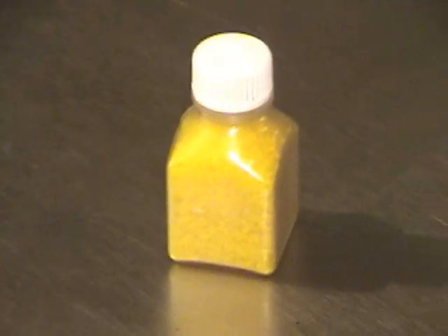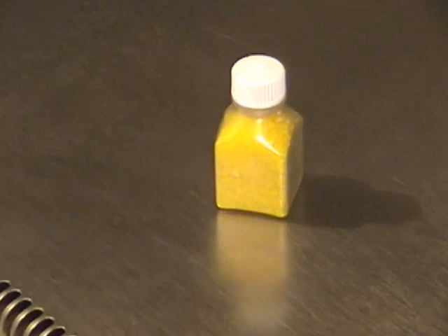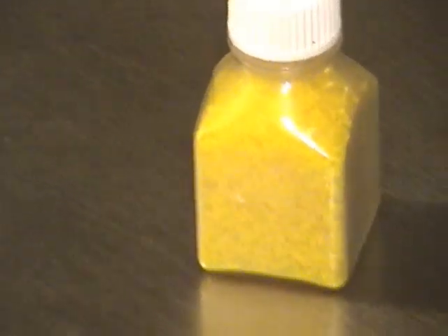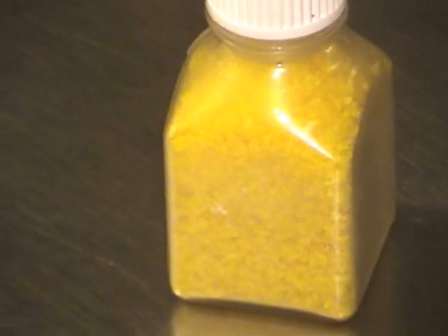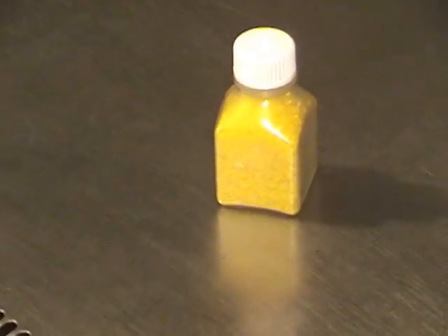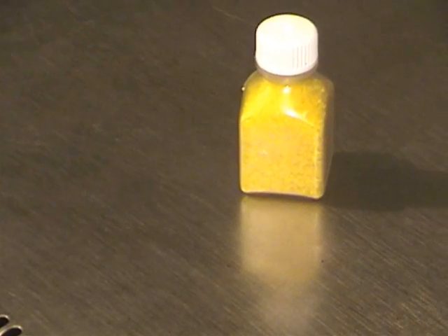Here's an example of some freeze-dried, or lyophilized, venom in a sterile container that's ready to go. This is eastern diamondback rattlesnake venom — just over 40 grams of venom.